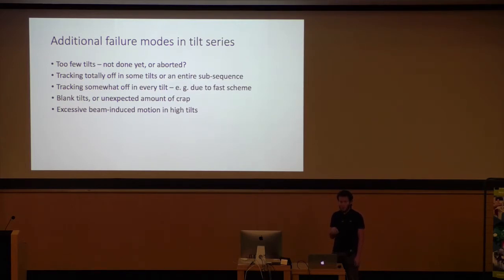I mean, not as much off as if tracking failed with previous acquisition schemes, but everything's going to be a bit off. And a lot of the voxels inside of your tomograms are not going to be covered by all of the tilts. You would like to keep your field of view that is covered by all tilts in the tomogram as big as possible. And due to some technical reasons, you might get blank tilts. Those are obviously not going to be alignable. They're going to throw off SerialEM totally. No, IMOD for the alignment.